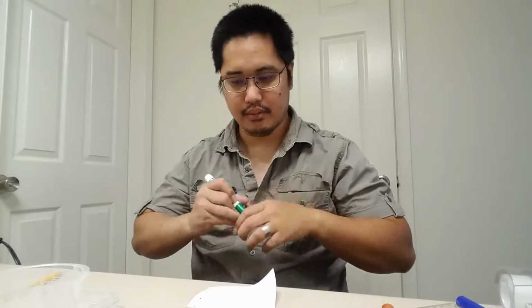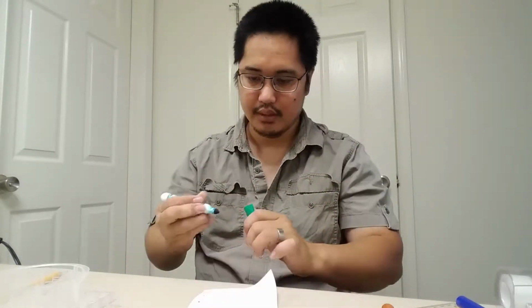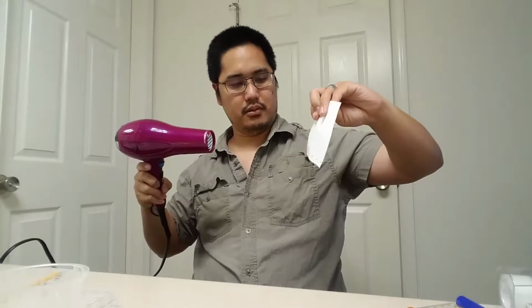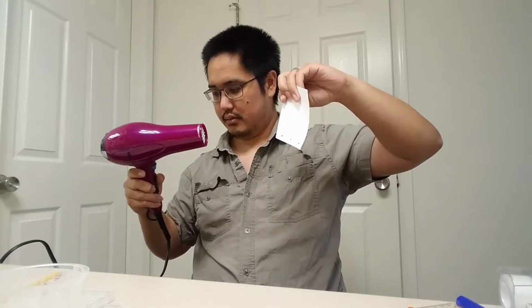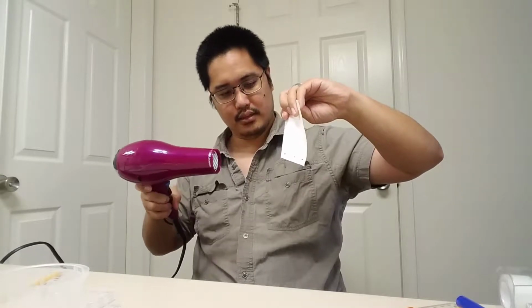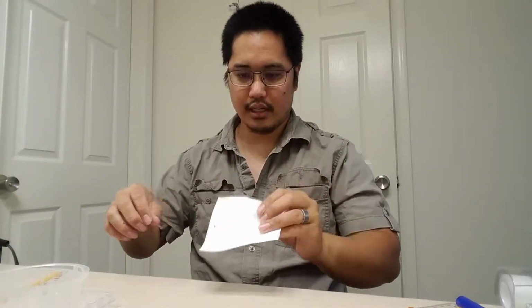And I'll put another one right here. Now, what I'm going to do is I need another drop of that stuff over here. So I'm going to put another drop. There's another drop. It needs to dry, so I need to wait for this to dry. Since I'm just doing a demo video, I'm going to cheat a little bit. There's my quick dry, and I'm going to put another drop.